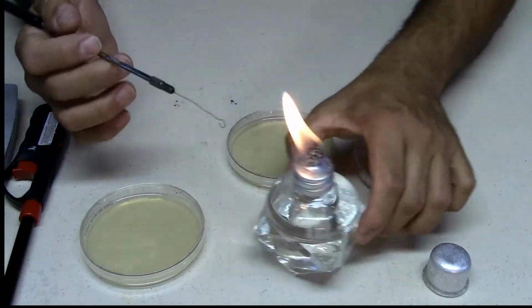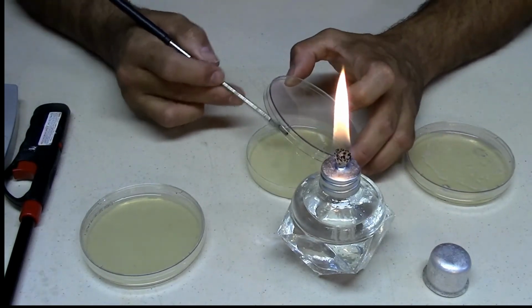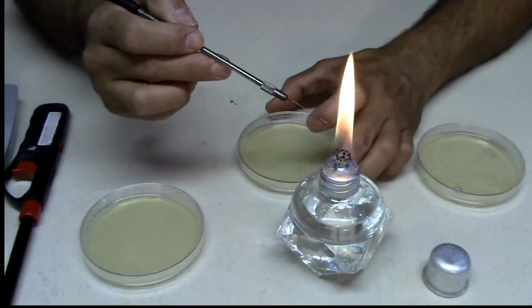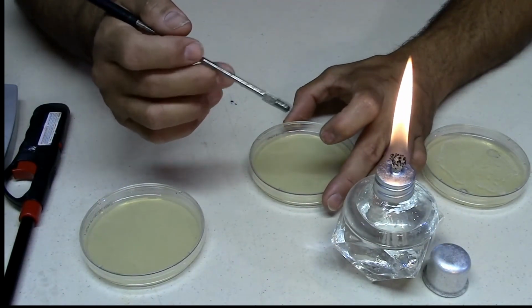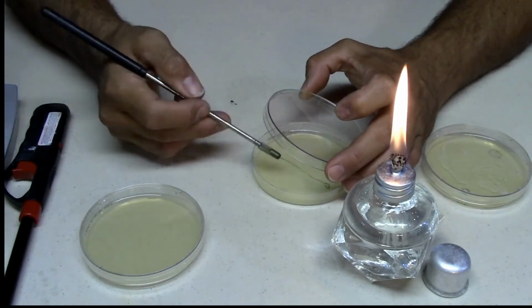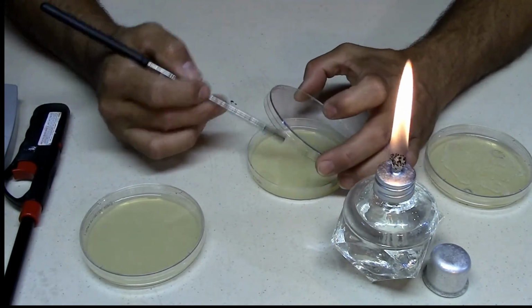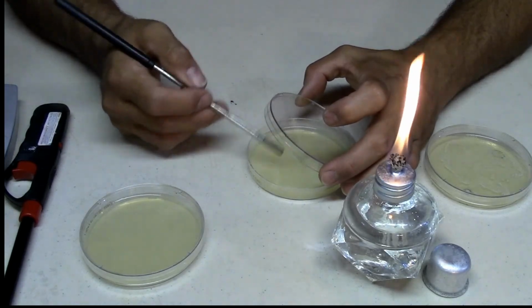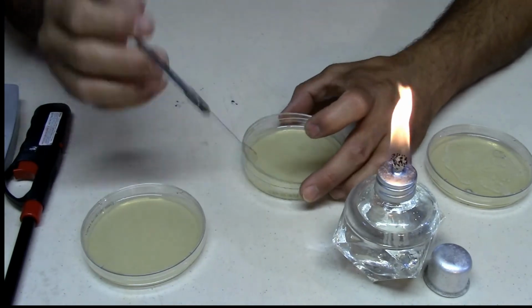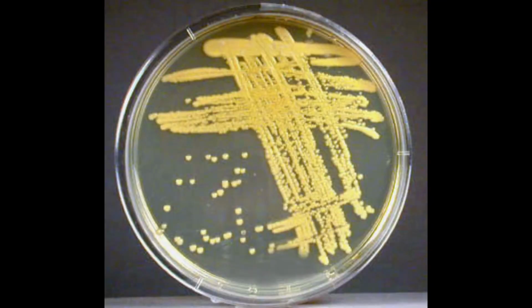Let's do a streak plate of isolation at a faster speed. So I'm flaming, picking up the bacteria, inoculating that, streaking on the first quadrant. After that, flaming. You see how I turn the plate, second quadrant, streaked, touches at least 4 times the first quadrant, again flaming, waiting for that to get warm instead of being hot. That's the third quadrant in there, flame again, and then just wait and perform the fourth quadrant. And there you have it.